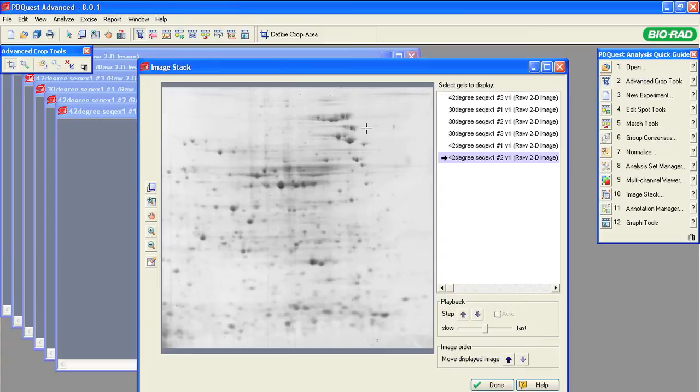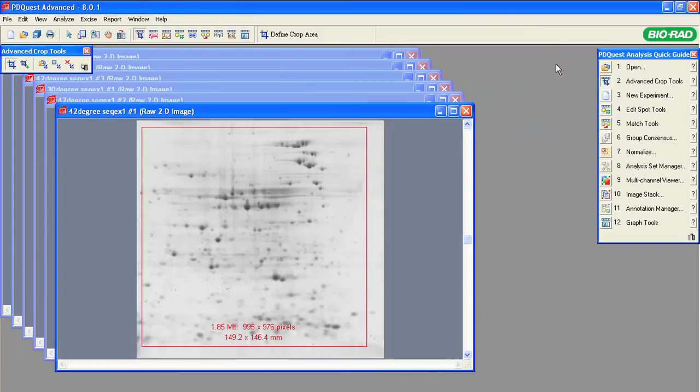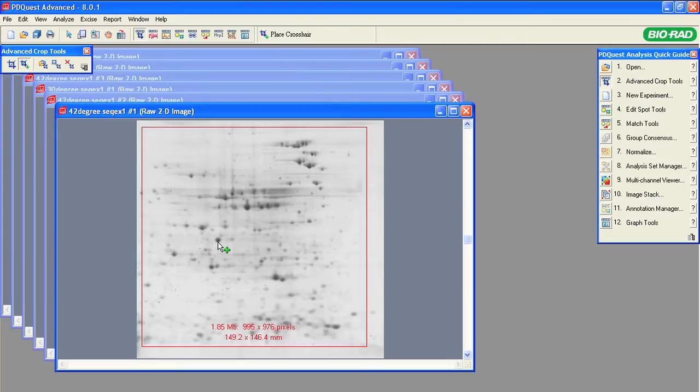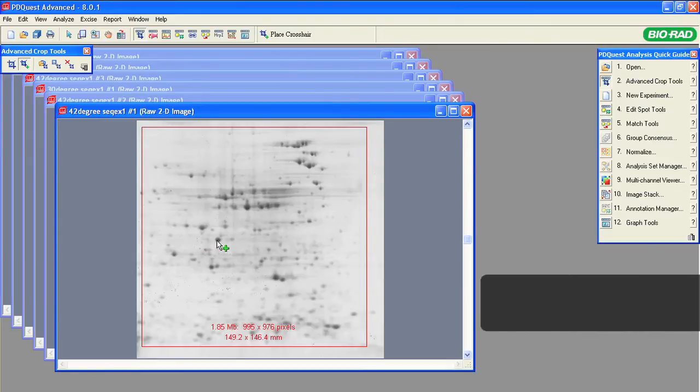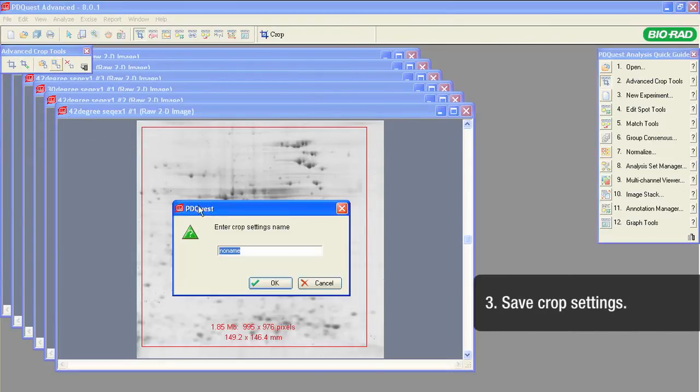This spot looks good for an alignment marker. Click on the Crop Alignment Marker button, the one with the crosshair icon. Place the cursor on the anchor spot and click Save Crop Settings.